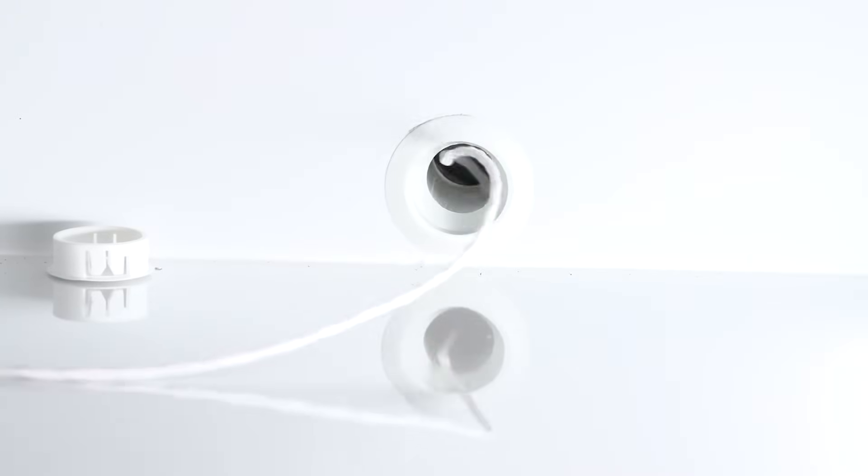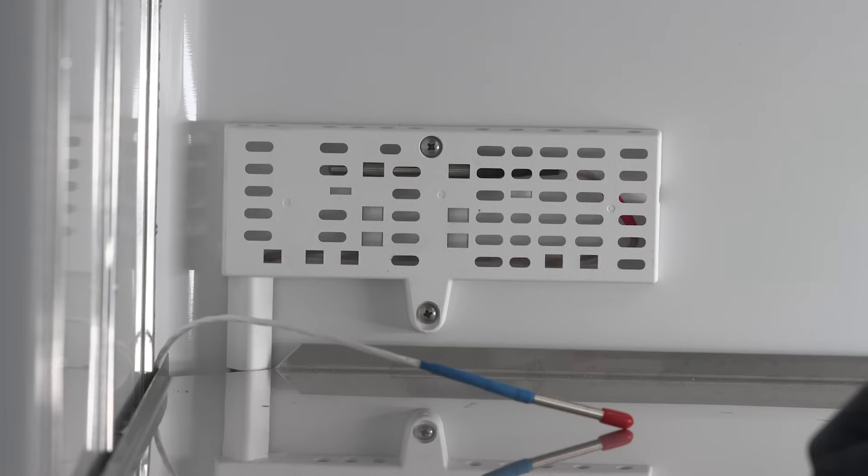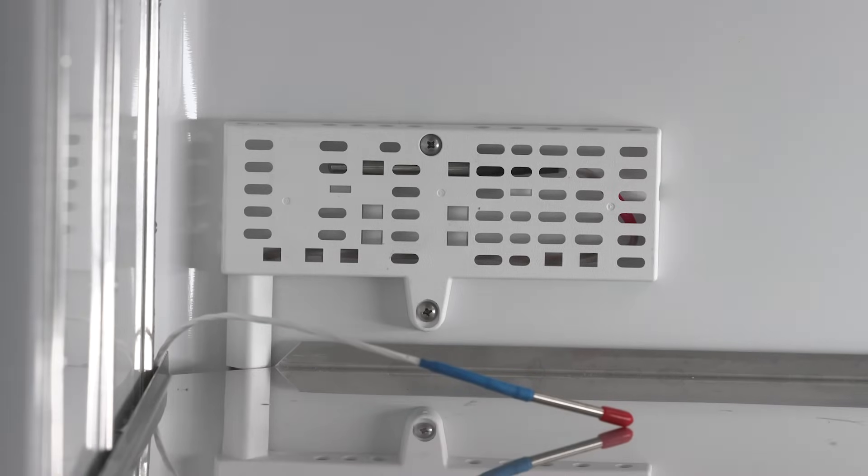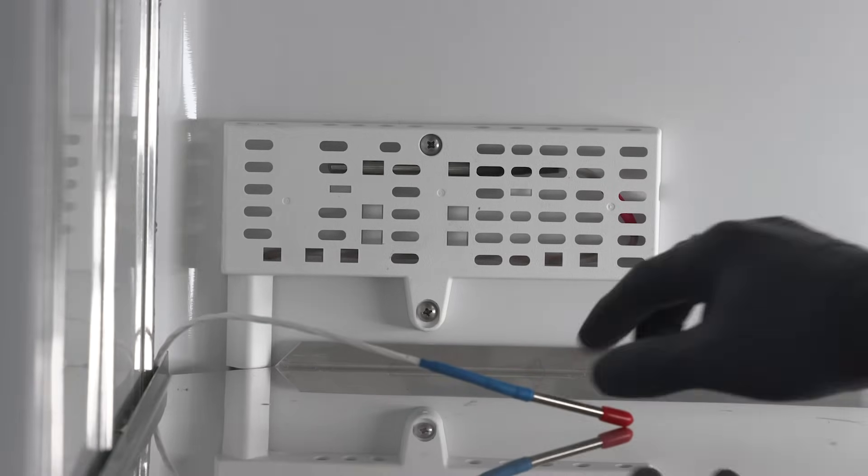Thermo Scientific cold storage equipment, like the TSX Universal ULT Freezer, comes with access ports for the routing of sensor wires.